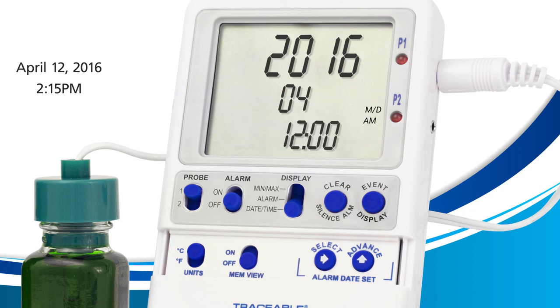Here, I need the number 12. I'll press the Advance button until I reach 12. Once it's at 12, we press the Select button to move on to the last row.